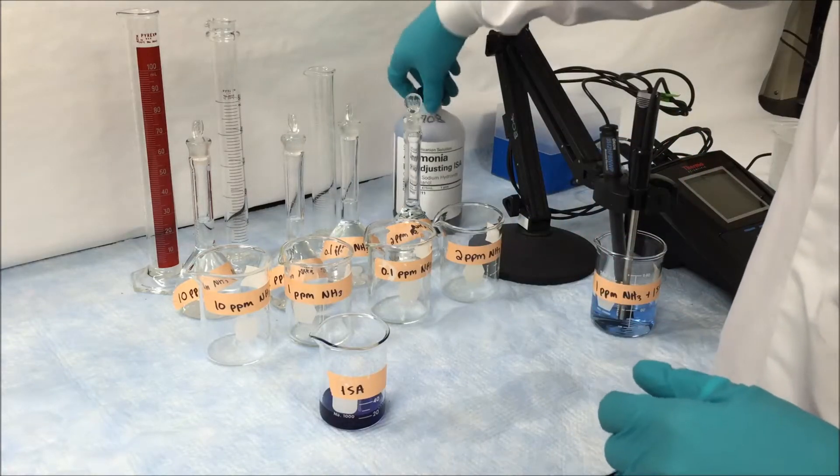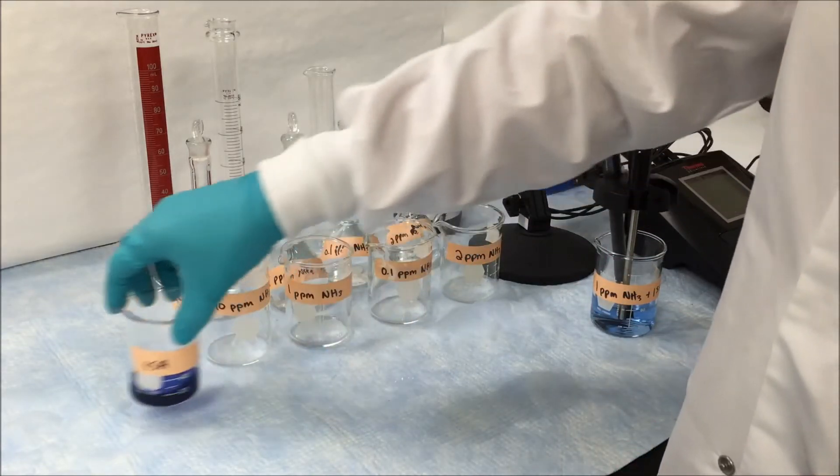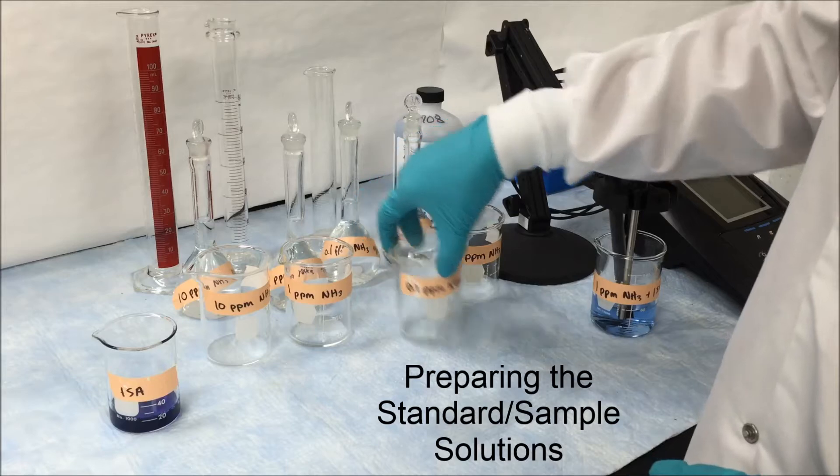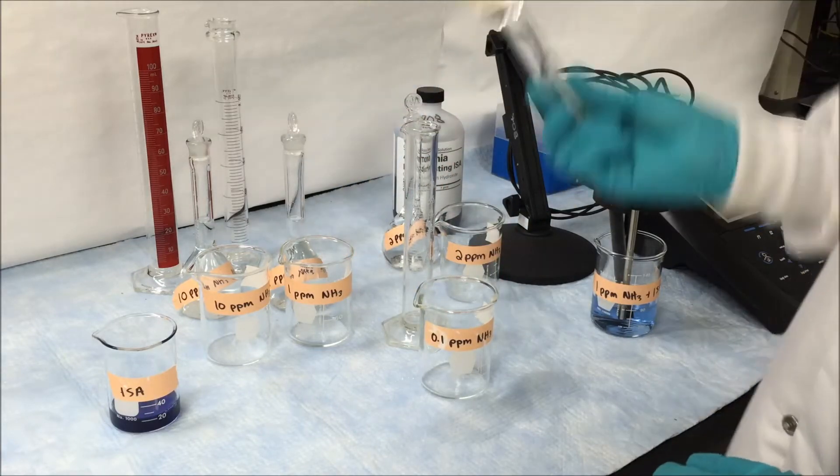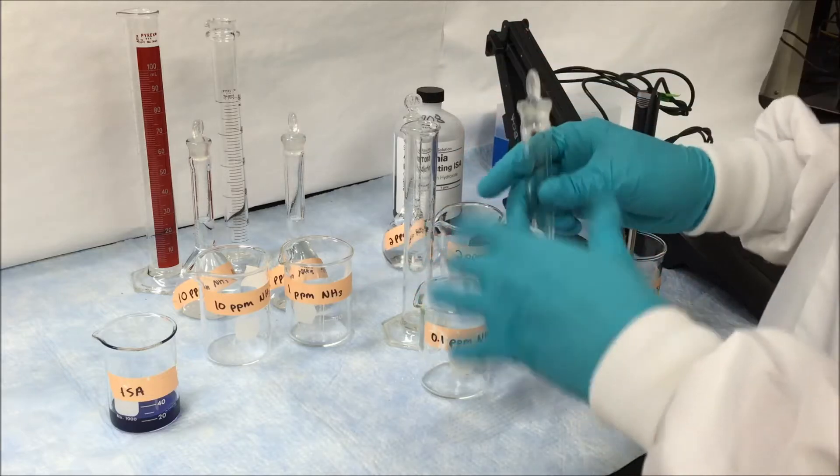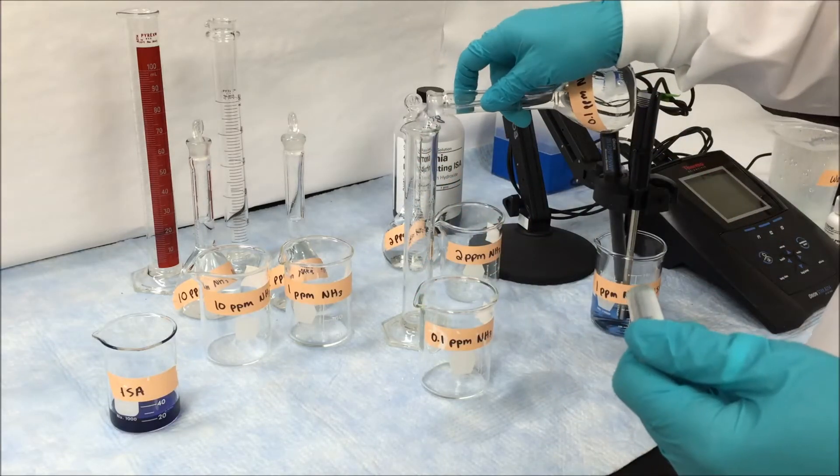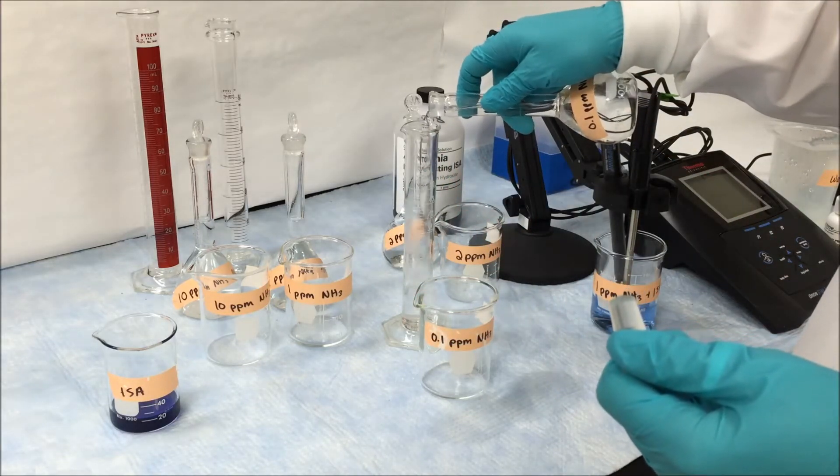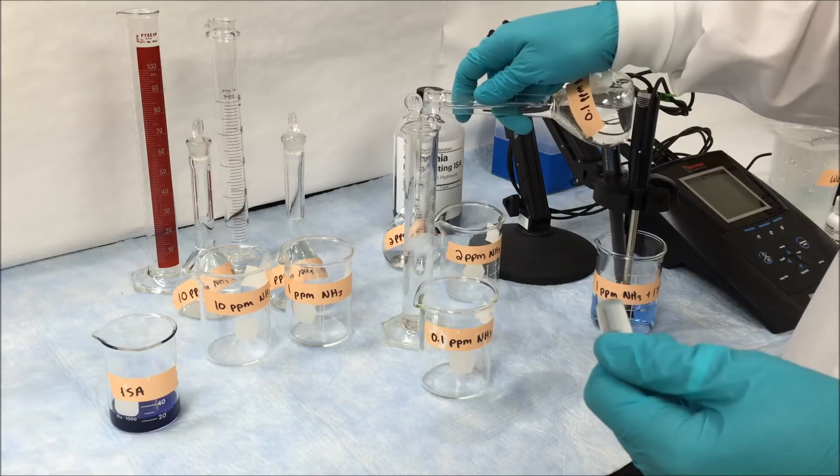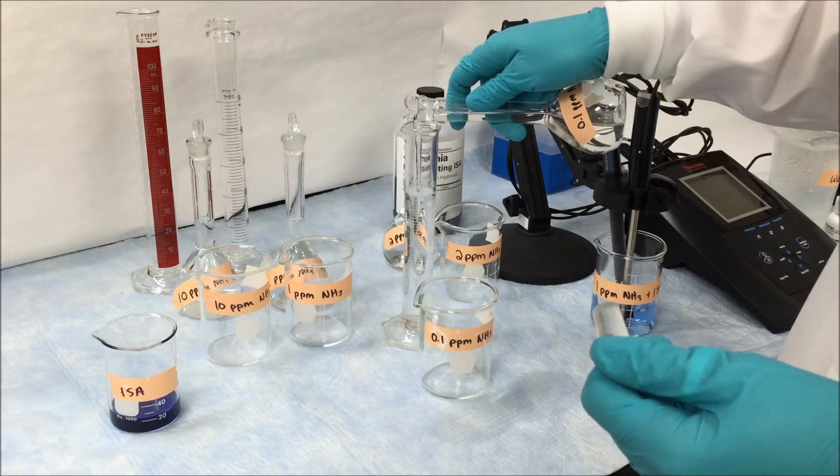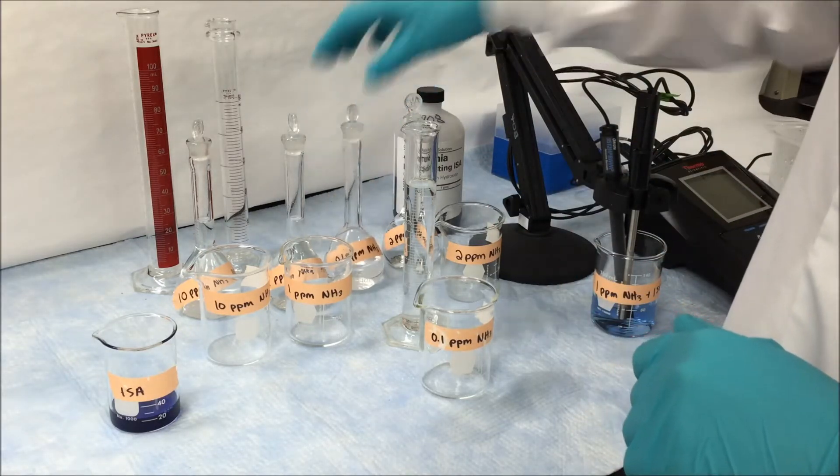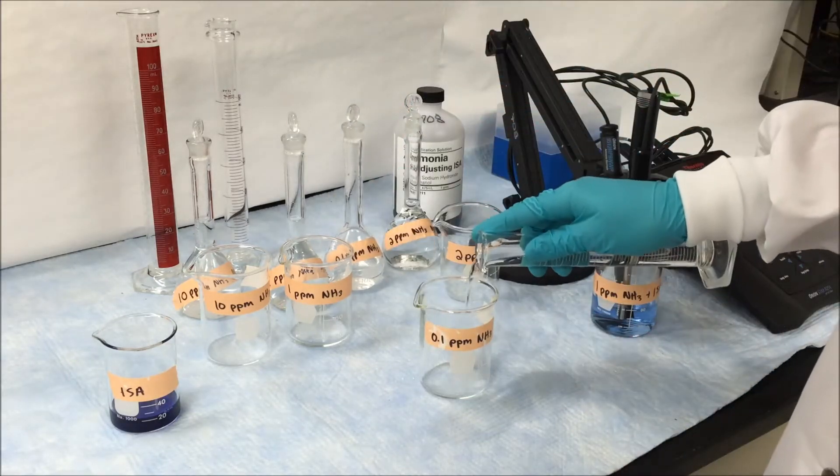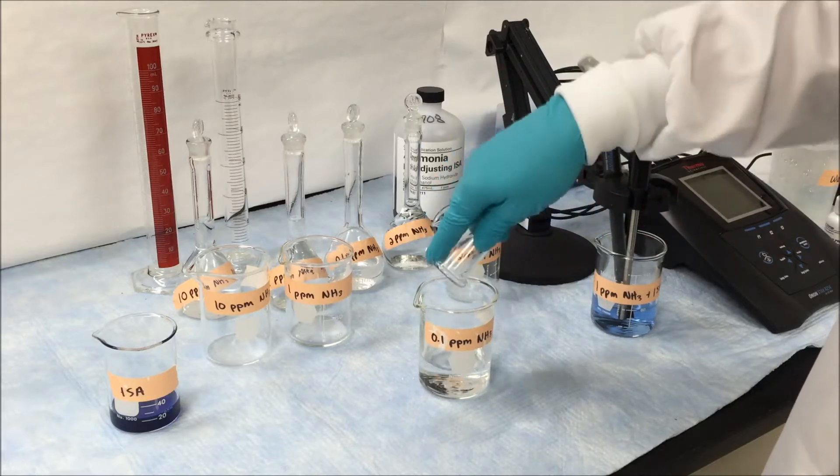First we start with our low level standard, the 0.1 parts per million. Using a clean graduated cylinder and making sure to mix the solution thoroughly, we pour out 50 milliliters of solution all the way up to the line, making sure that the meniscus is touching the line. You want to make sure that the bottom of the meniscus of your solution is touching that 50 milliliter demarcation to ensure that you have 50 milliliters of your standard calibration solution.